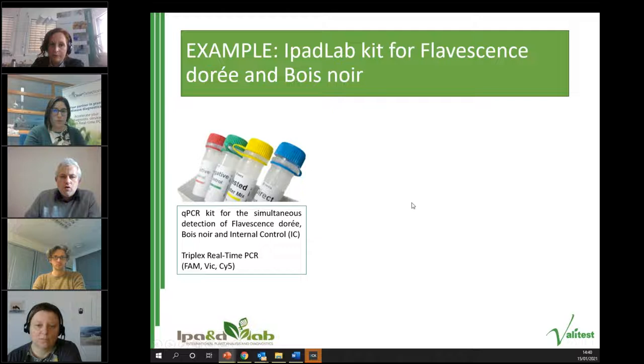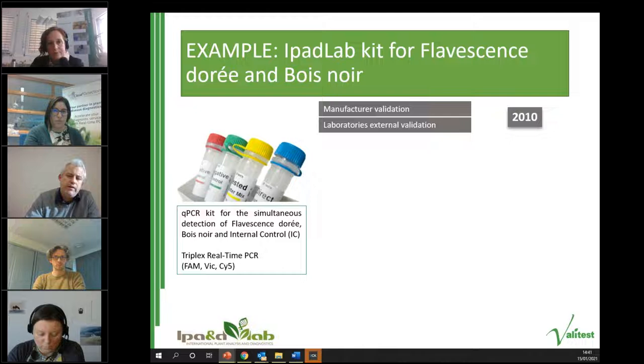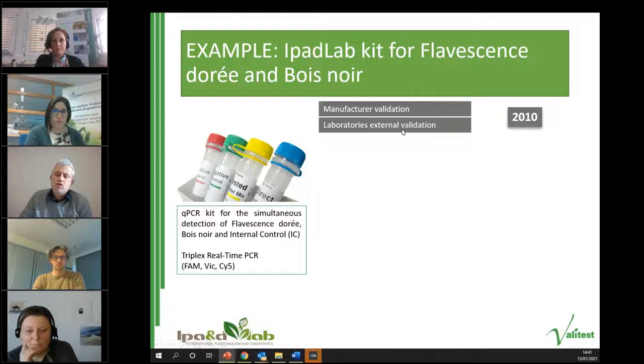So in this slide, I will show you an example of a kit that we have developed in IpadLab on flavescence dorée and bois noir. It's a triplex real-time PCR, and I will show you how long it can take to pass from the development to the final recognition by the market. So the manufacturer validation started in 2010, and external laboratory validation started together.